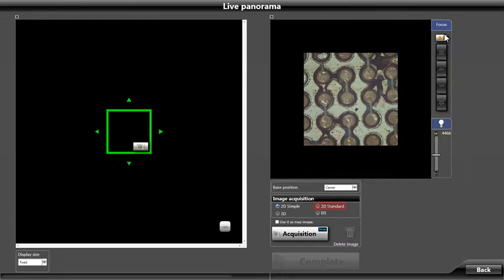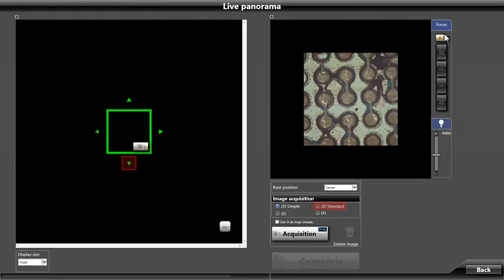2D Standard allows us to capture the single field of view, then click on the corresponding arrow or manually move the stage to the adjacent field of view to stitch. This allows for an overlap of the images for the software to perform pattern alignment improving the stitch quality.